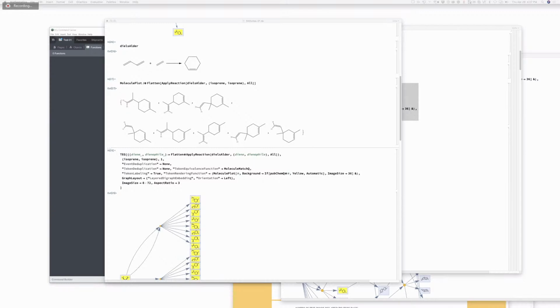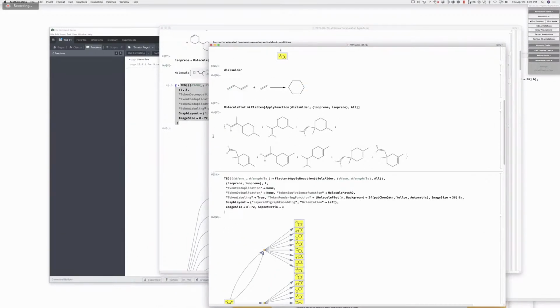What is the typical time to do this? Assuming that you have the ingredients available at your facility, what's the typical running time for things? Is it ever minutes, or is it usually hours? We try to schedule it. If you're giving us something novel, the first thing it's doing is resource planning in the facility to get access to it. If you're continuing off of a script, so you already did, we can path plan ahead and we know 5 experiments ahead what you're going to do, then yeah, it's minutes to get through. If you're giving me something from scratch, 0 to 60 right now, we try to target it to be 5 hours. So that's generally the time.